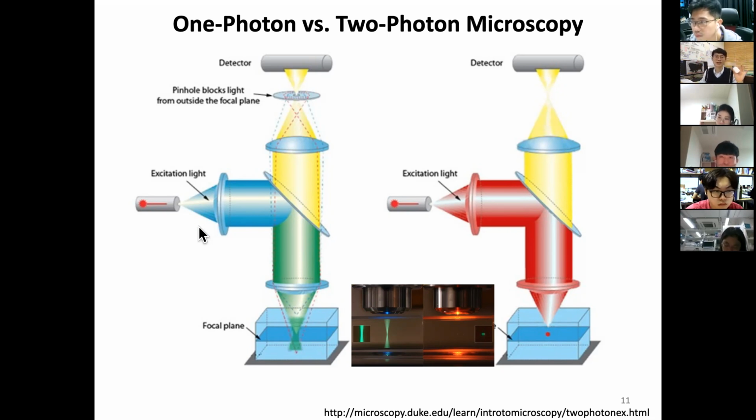But this is great and amazing, it looks like magic. In 3D space, only one point. And you just move around this point laterally to create a plane image, and also up and down, you create 3D or true 3D images. Compared to that, confocal is a tricky 3D, because you actually shine above and below. And what's bad about this?